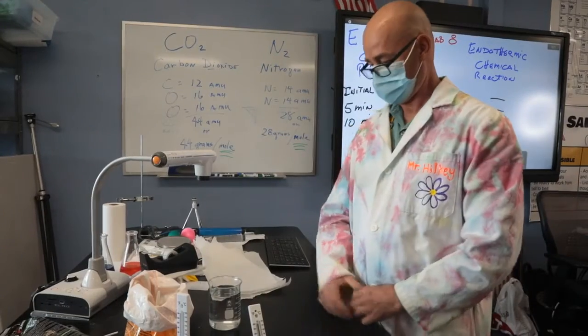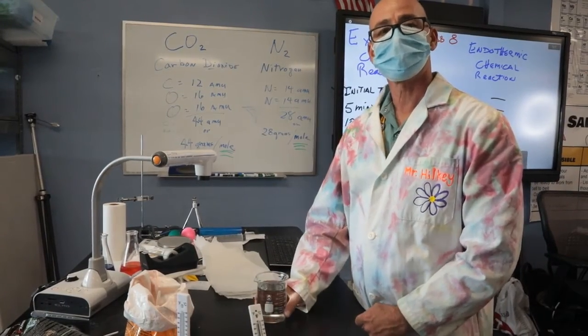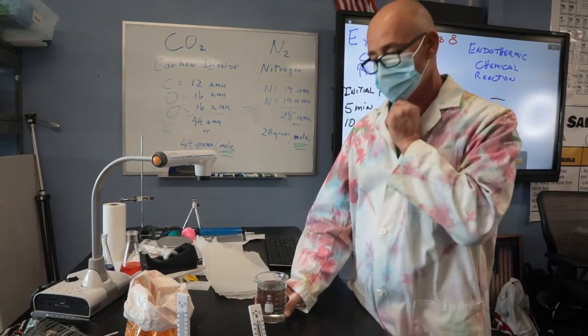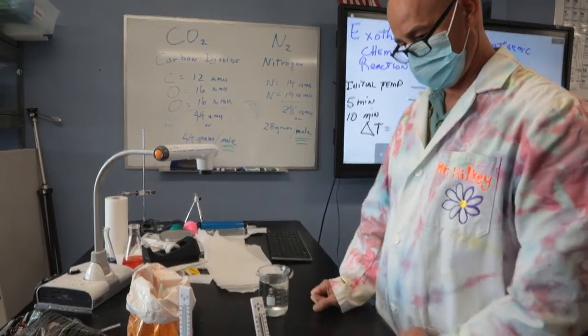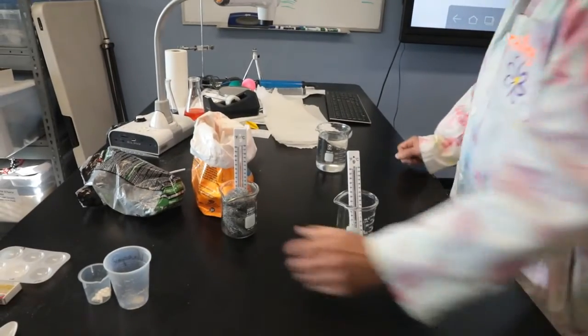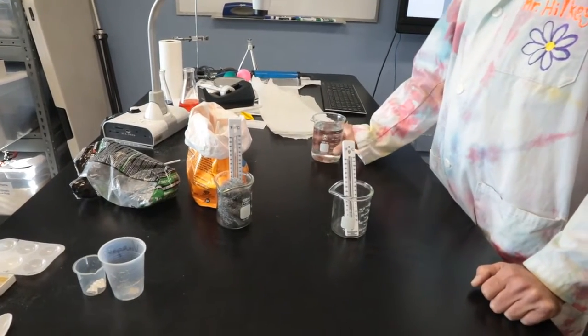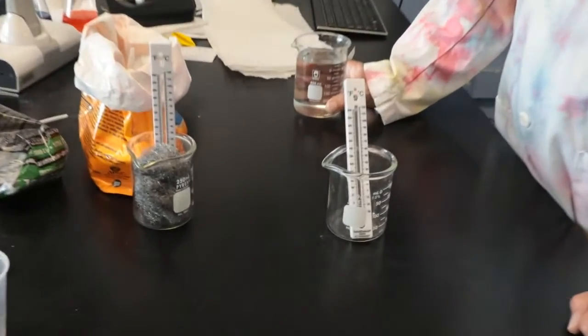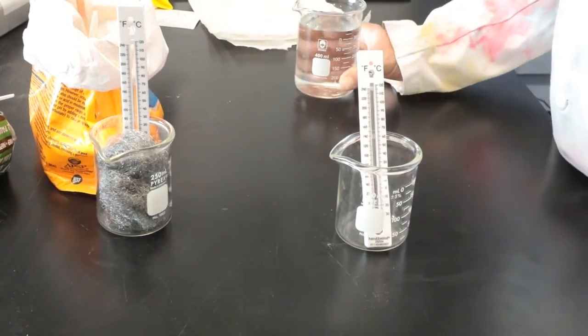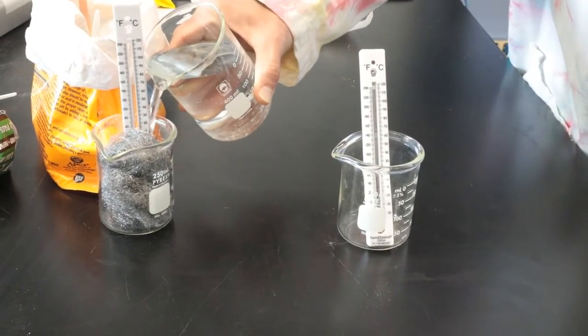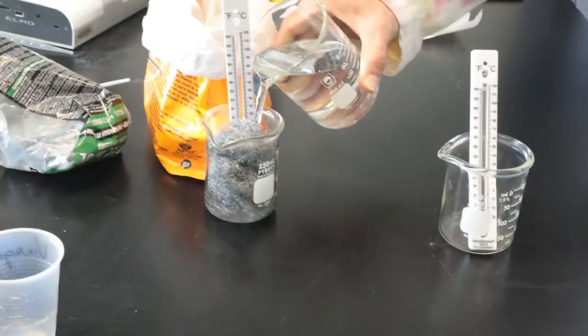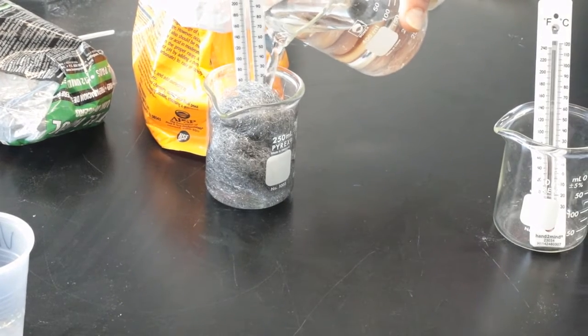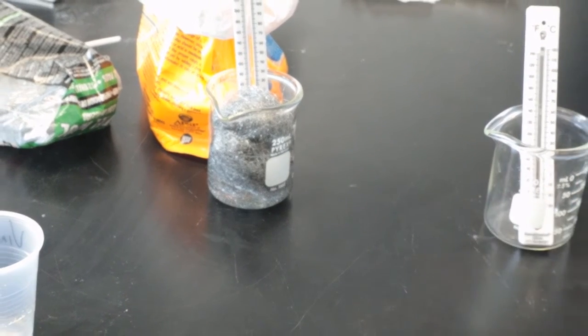So first thing we're going to do is the endothermic reaction. David is going to pour acetic acid, a.k.a. vinegar, into both of these beakers, probably just enough to cover the thermometer. Why don't you put about 150 milliliters in each beaker. A little more, up to that 150. And 150 milliliters into the other reaction.